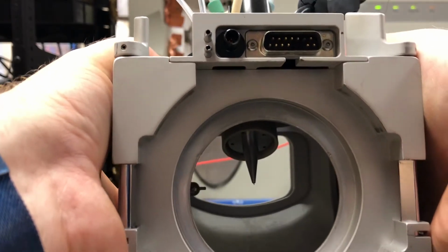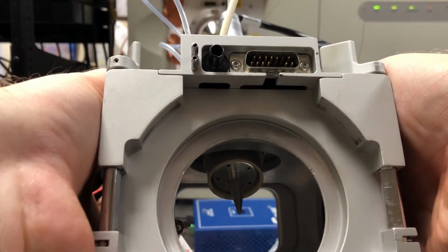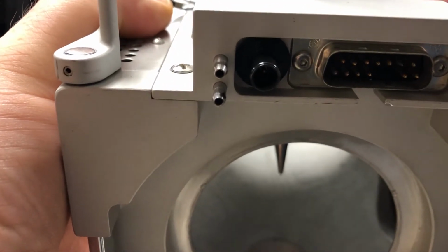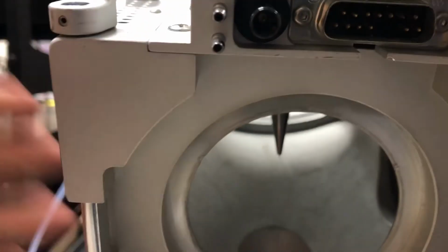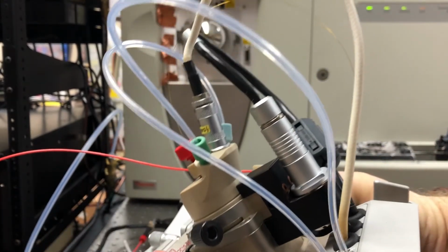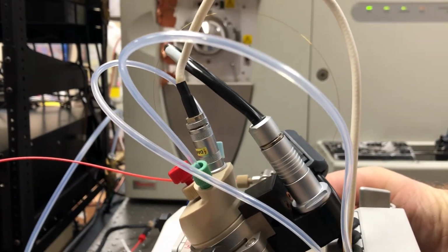If we take a look at the electrospray source here, we can make out this needle on the tip, and that's going to be really, really important. That needle right there at the tip. When we swivel this around, we'll see that there are connections for gas, to get gases in if we need them. There's a connection to bring the voltage in and to bring the liquid in.